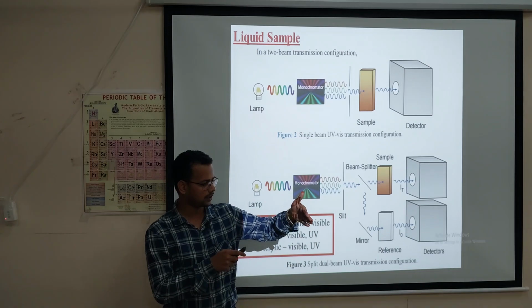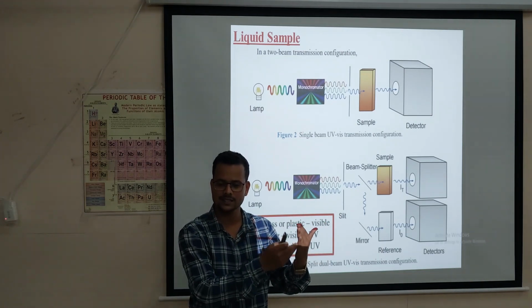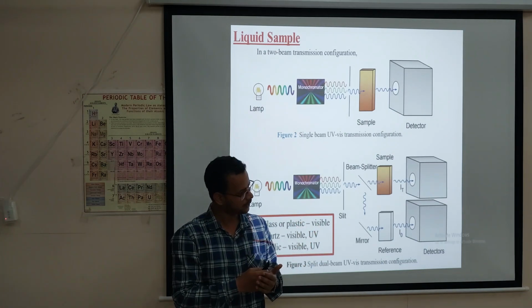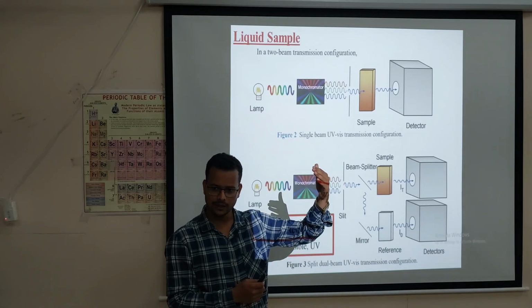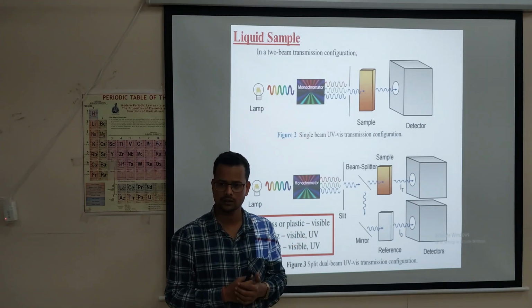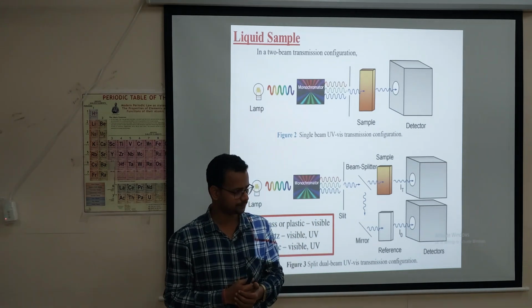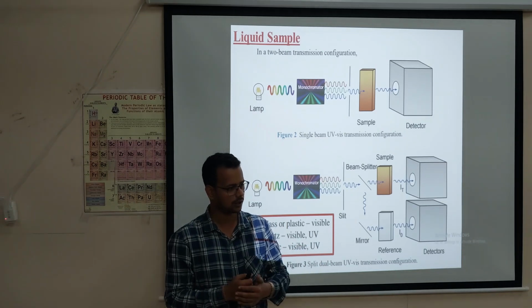Suppose when blue light passes through the slit, that sample may not be excited, but when green light passes, it may. So when different wavelengths of light pass through, that may cause excitation of the electrons of the sample. Yes, it is possible.